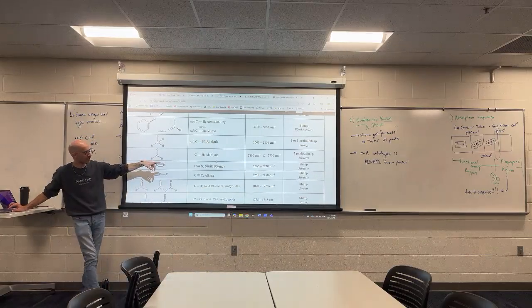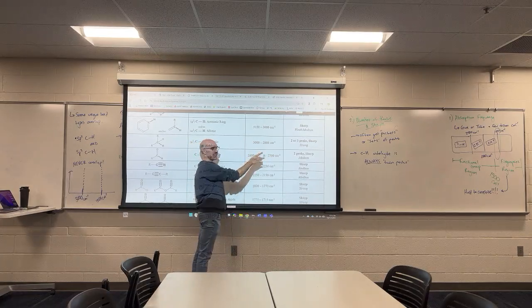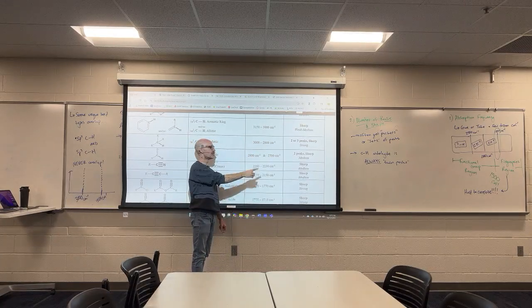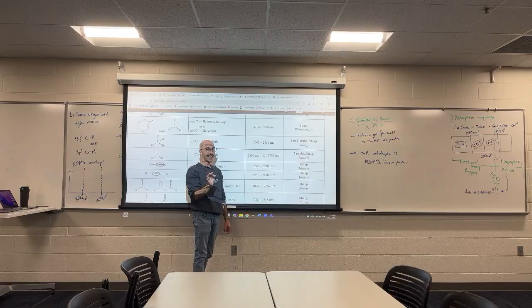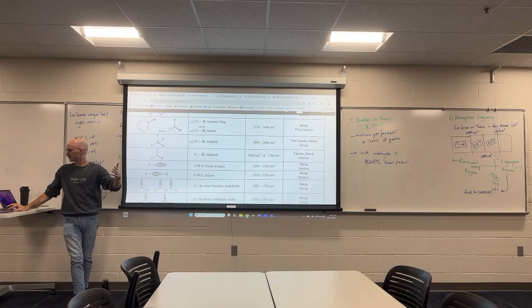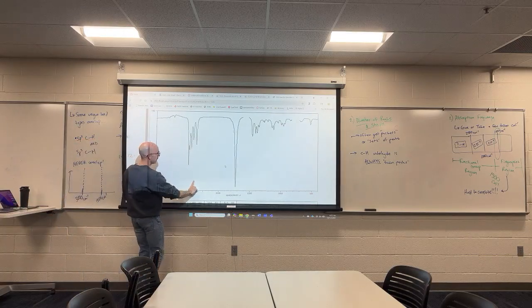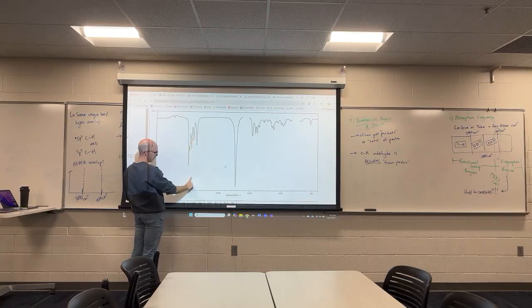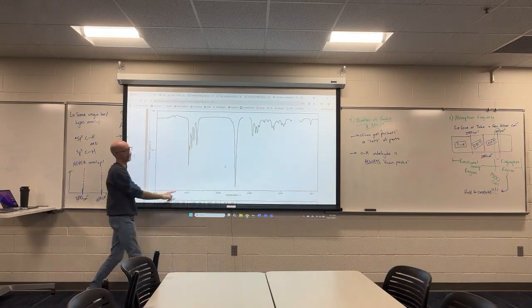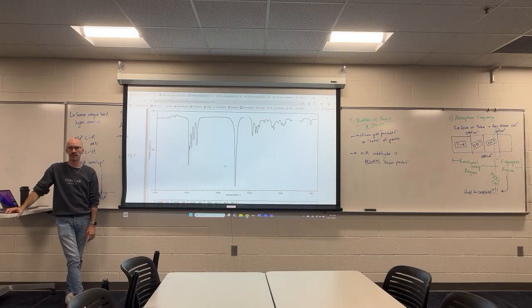I do want you to notice that saying 3000 to 2800 is different than saying 2800 and 2700. That's not here through here. That's this and this. 2800 right here. 2700, right here. Twin peaks, indicating that I have the CH of an aldehyde.